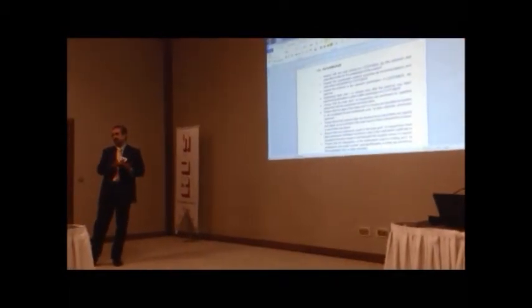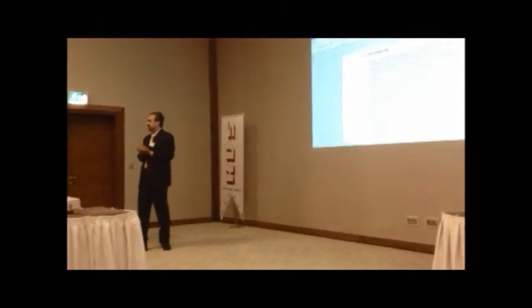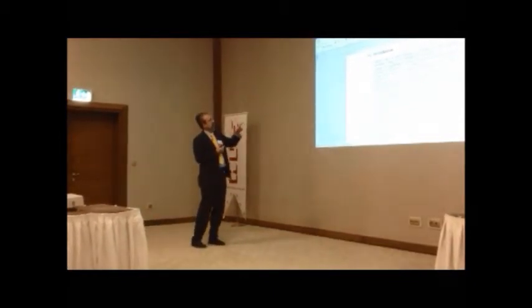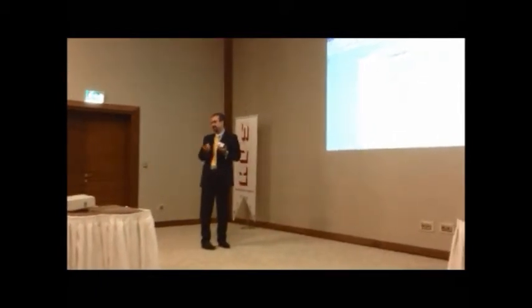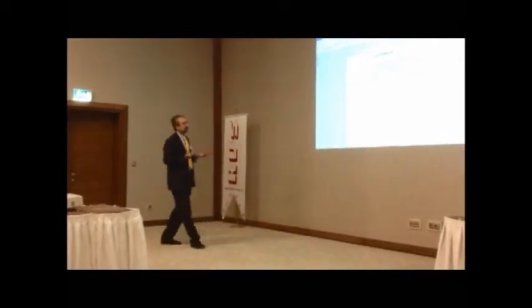So we had our curriculum vitae to show that this is not the first autoclave that we perform, and the man that we send has the experience. We are responsible for the data, that the data are real, the true data without any modification.